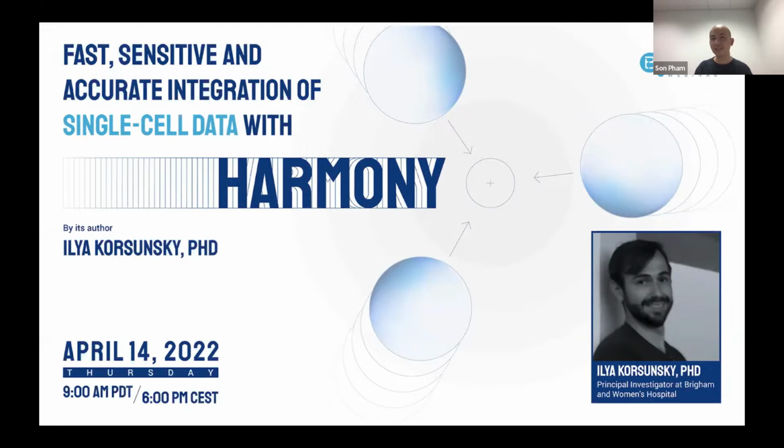And of course, if we consider the last factor, there are still a few tools left, including Liger, including Seurat, including Harmony. But if you have limited computing resources, and even without the computational resource constraint, I believe that the first tool you have to try is Harmony. And it is my great pleasure today to introduce Ilya Korsunsky.